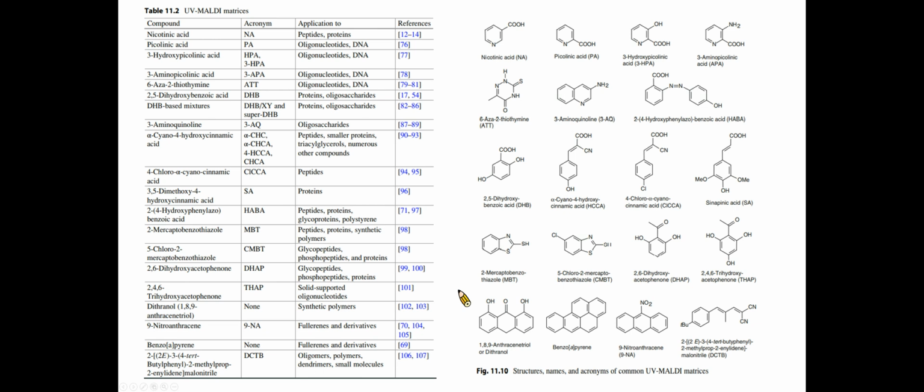Recently, a series of new matrix materials has been reported which can reduce or remove the matrix interference, such as high molecular weight porphyrins, surfactant-suppressed matrices, inorganic materials, carbon nanotubes, and porous silicon. In addition, adding matrix additives to the matrix solution can improve the analytical results and greatly improve the sensitivity, reproducibility, resolution, and signal suppression of desorption.